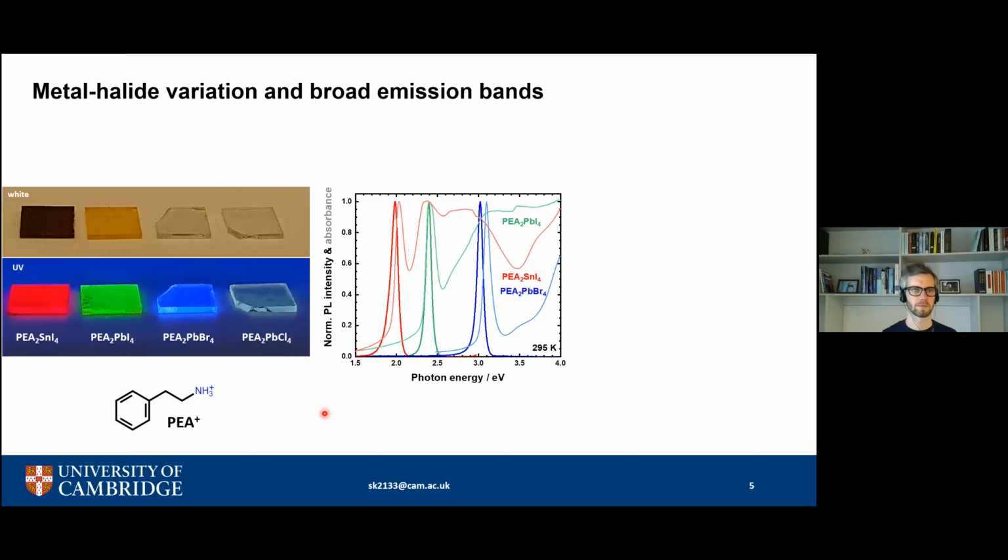Now let's use UV light, and you can see that these materials actually exhibit very bright and nice colors. So red, green, and blue emission. That's of course very nice if we think about RGB applications. We want to use them in LEDs. Also, it's not just nice that we have bright colors, but they're also narrow emission lines. So that's again a very nice benefit of these materials.